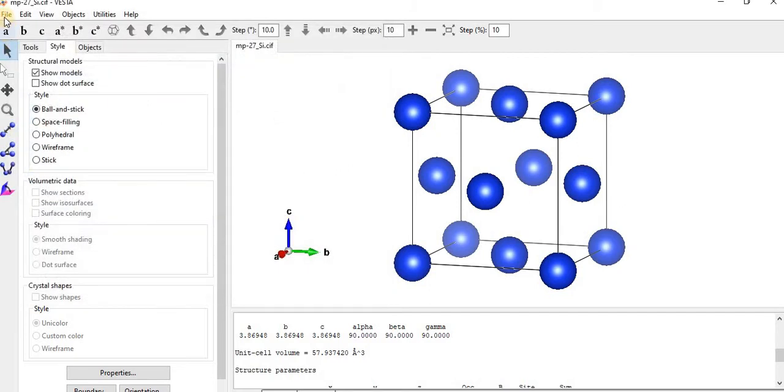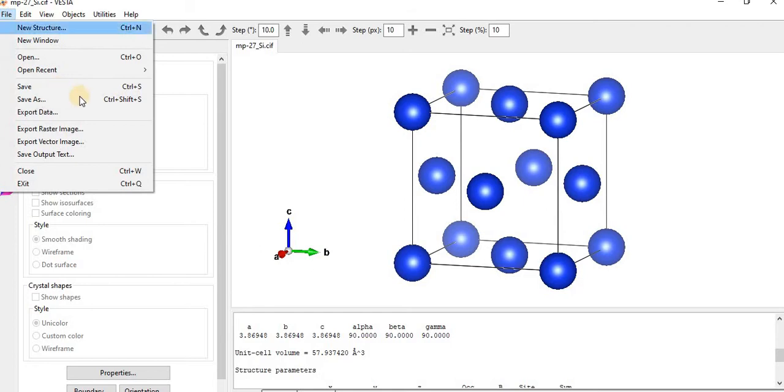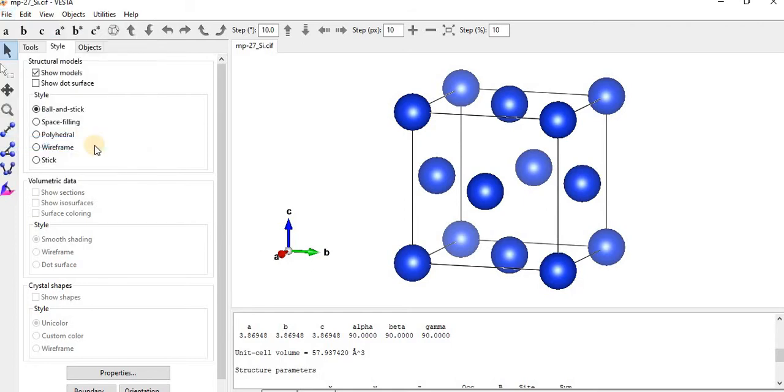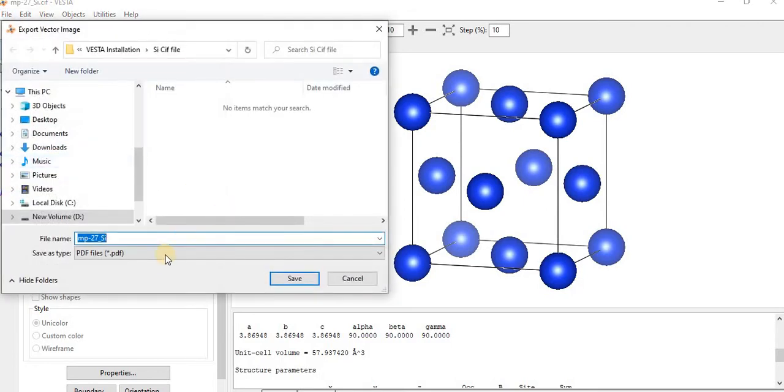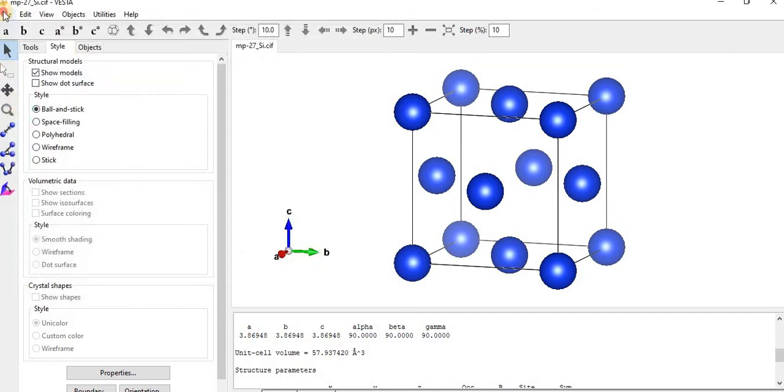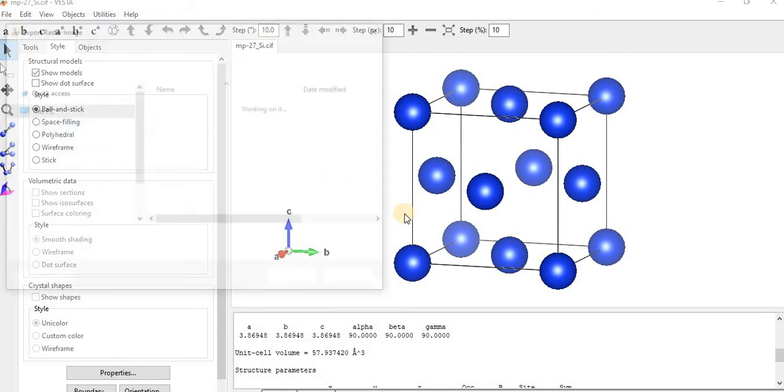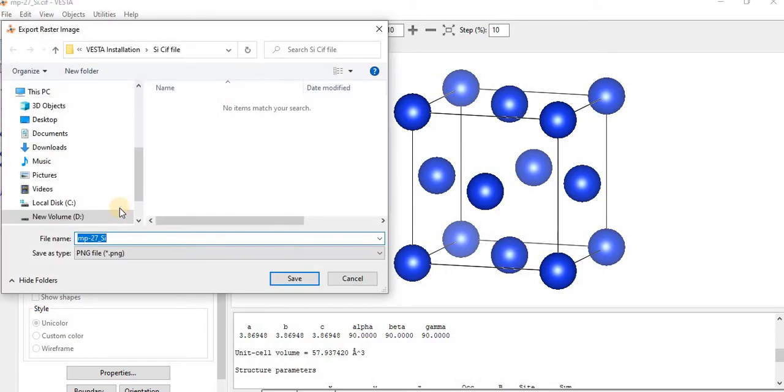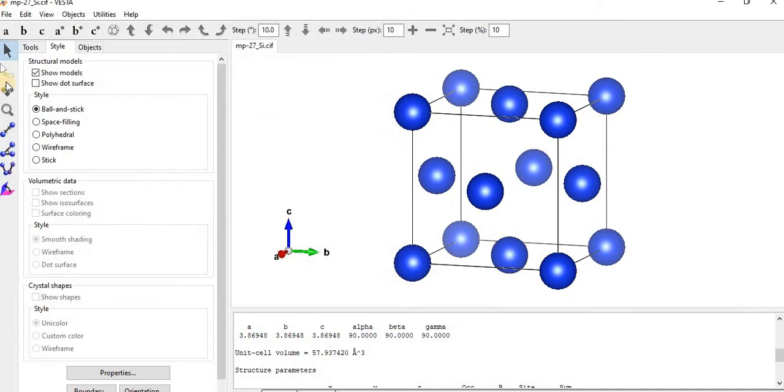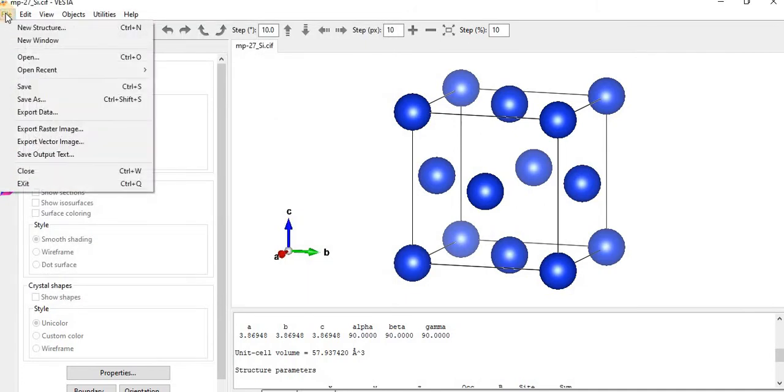So next, click on File, then Export Vector Image... actually, Export Raster Image. Let's see again. Click on File, now on Raster Image.